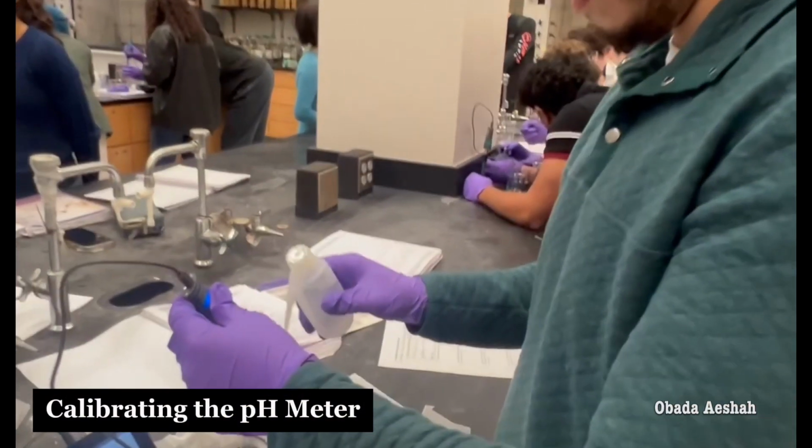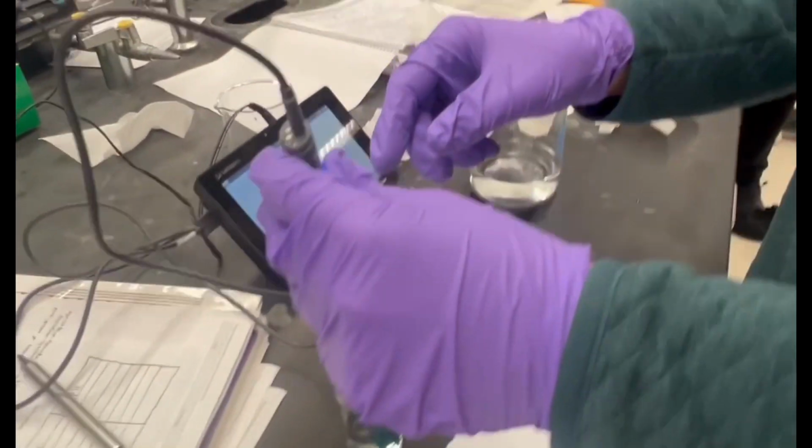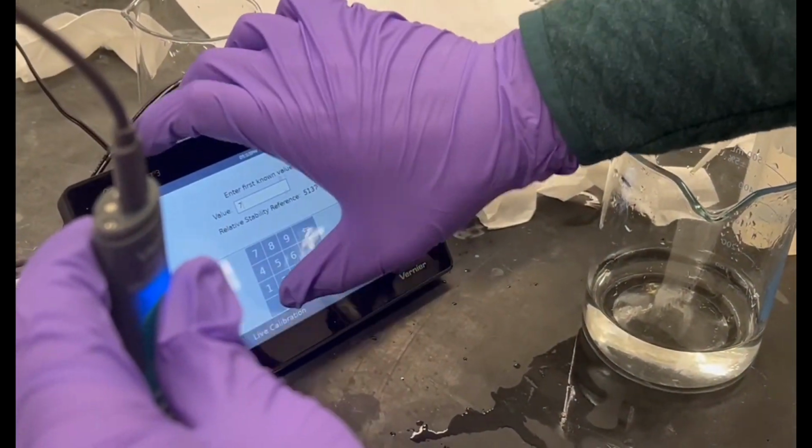Before measuring the unknown, you have to calibrate the pH meter. First, you have to rinse it with distilled water. Once it is rinsed with distilled water, you have to go to 2-point calibration and put the probe inside the pH 7 buffer. Once it stabilizes, you type in 7 with the appropriate amount of decimal places.